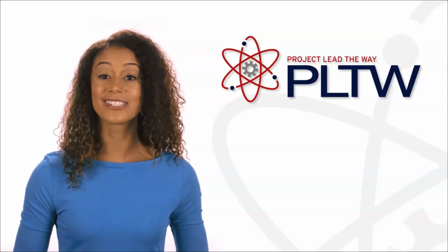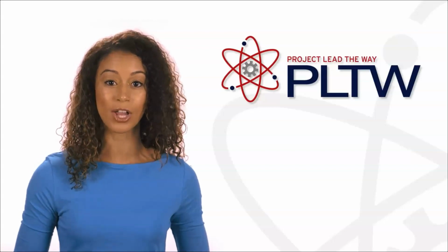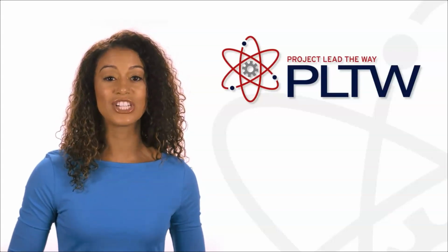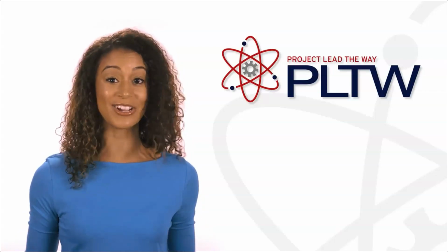DNA sequencing is how scientists determine the precise order of nucleotides within a DNA molecule. Many different methods are used to perform this process, and even now, next-generation sequencing methods can sequence an entire human genome within a single day. For this presentation, we'll focus on a common method used to sequence DNA for clinical purposes, called cycle sequencing.